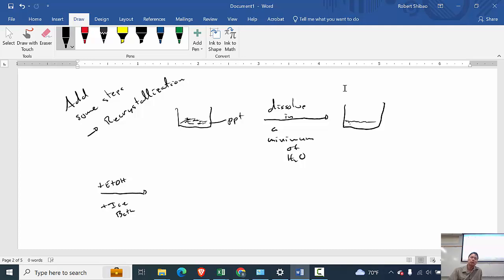But what I'm going to recommend is in this recrystallization, we're going to add the ethanol and then just try to get some crystallization there, ice bath. And then we're going to leave this in our drawer. So hopefully we get some precipitation. You don't want to maximize. Okay, you don't have to maximize precipitation.